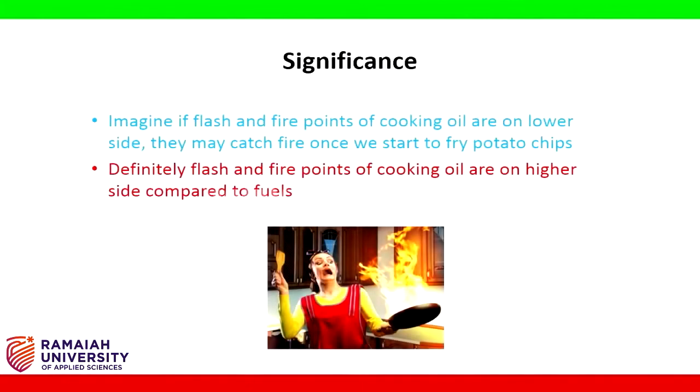Imagine if flash and fire points of cooking oil are on the lower side. They may catch fire once we start to fry potato chips. Definitely, flash and fire points of cooking oil are on higher side compared to fuels. Hope you understand.